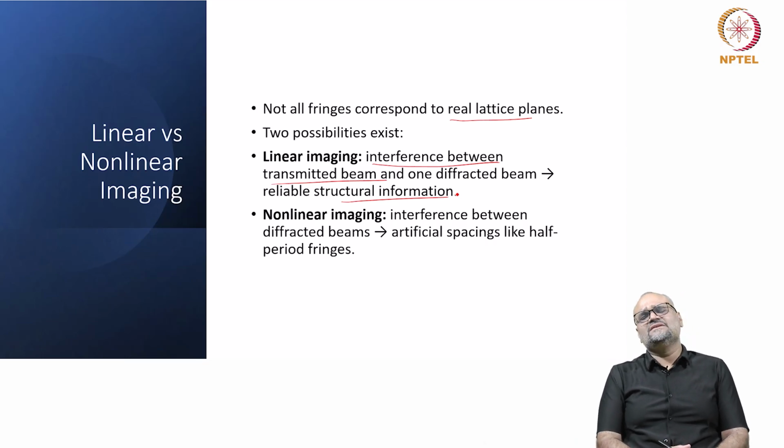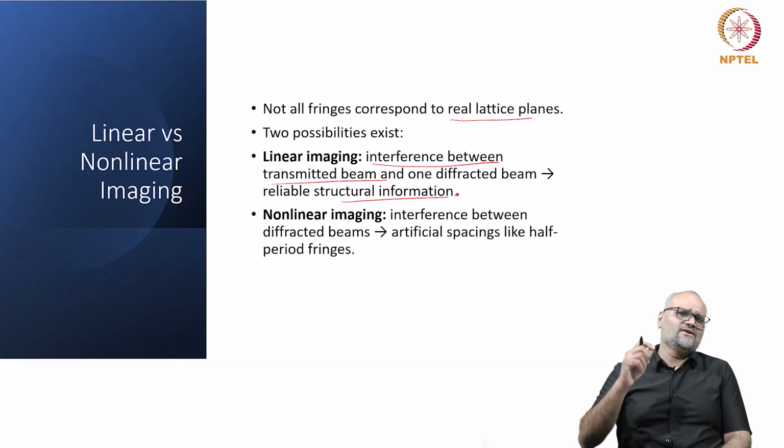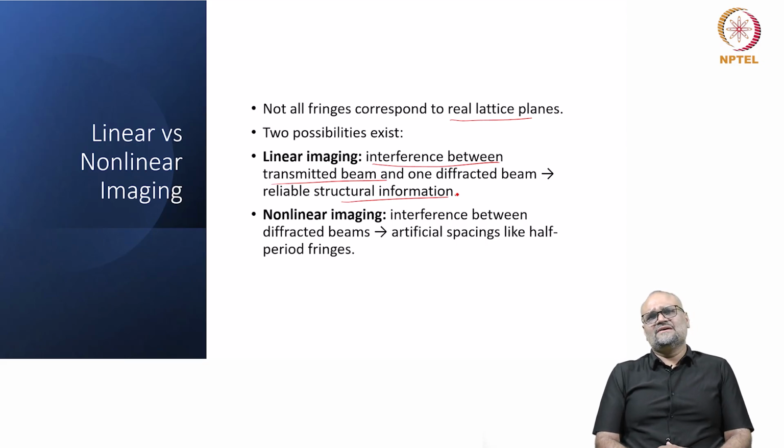So, unless you know the thickness of the specimen, at what focus the images are recorded, and what sort of spherical and chromatic aberration exists in the imaging system, there may be various factors which can modulate the phase of the object wave while it is propagating through a lens.